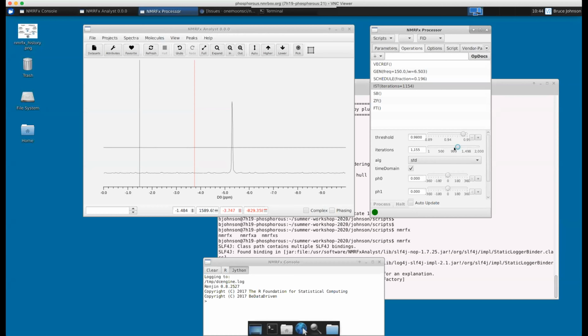That's a good question. Here's one thing that might be going on: for almost all of these algorithms, there's a huge question of how to know when to stop. If you keep going too far, as I said, you end up getting down into the noise.